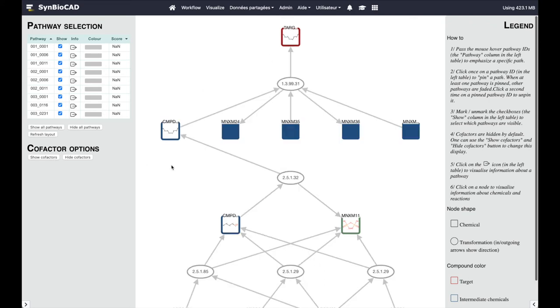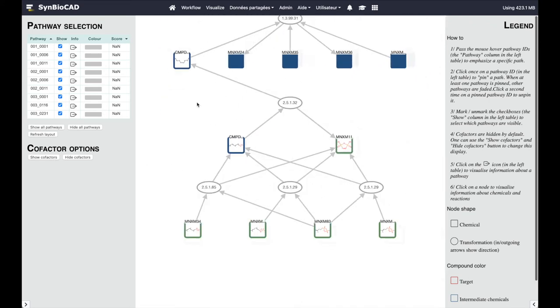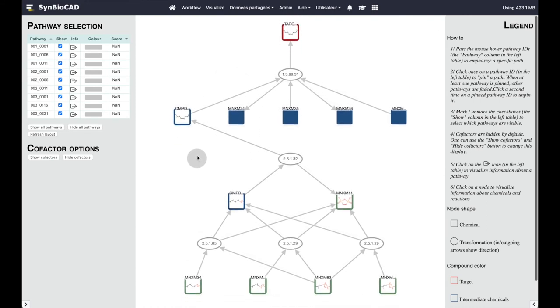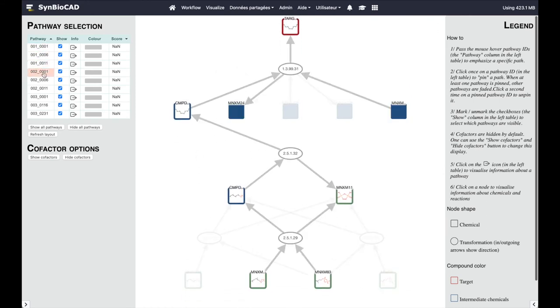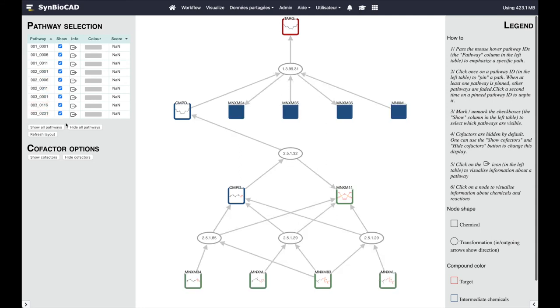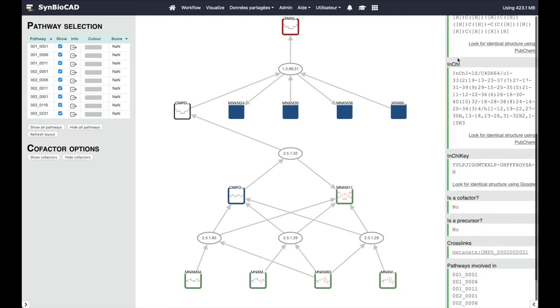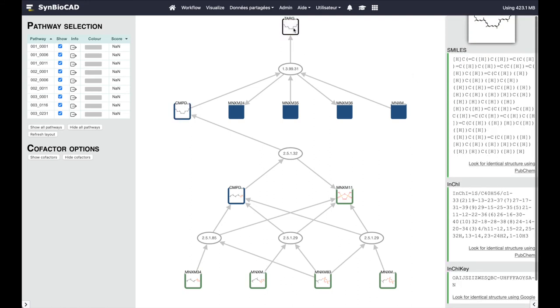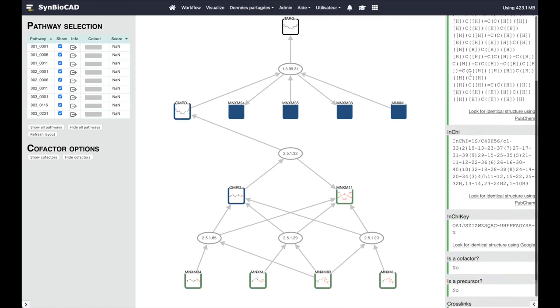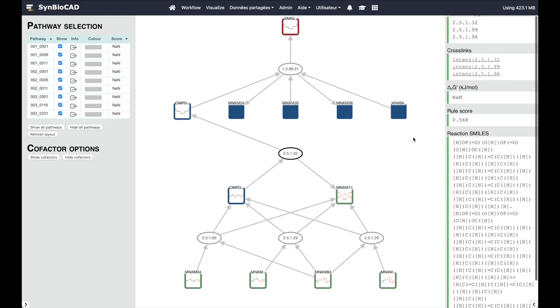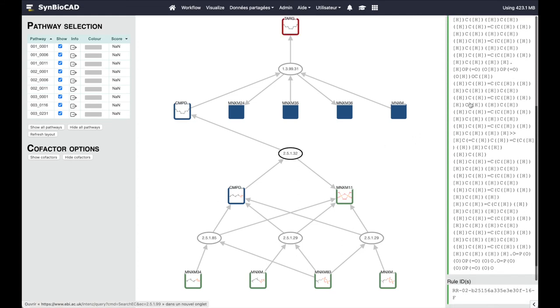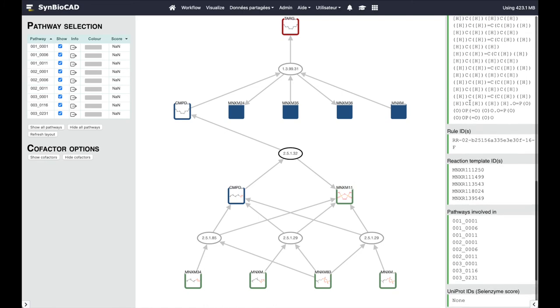We can show the cofactors and we can highlight each pathway by hovering it in the top left window. If we click on a compound we can see the details in the right panel. In the same way if we click on a reaction its characteristics appear in the right panel.